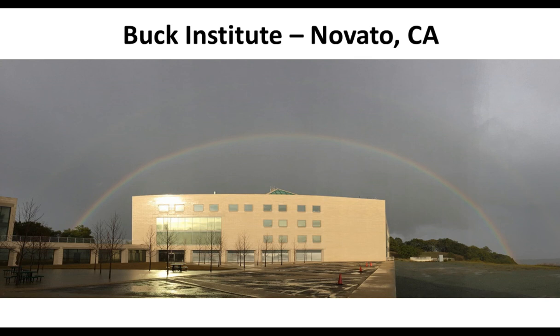A great example is the acetylation. That's actually a mix of 7 different monoclonal clones, and we did that to really maximize coverage and get one reagent, one tool that should, in principle, be able to pull down any lysine acetylated peptide.